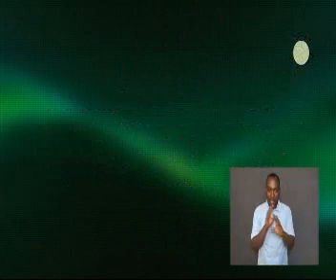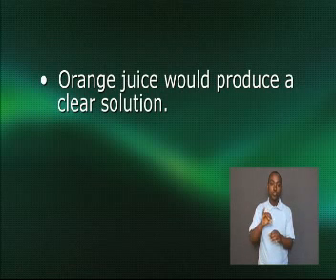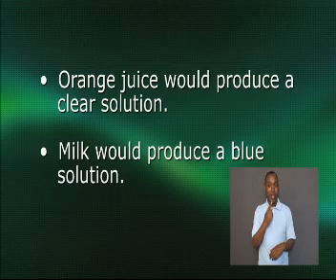Time's up. Let's get back to our lesson. Welcome back, students. If you said that the solution with the orange juice sample would be clearer and the solution with the milk sample would be blue, then you are correct. Great job.